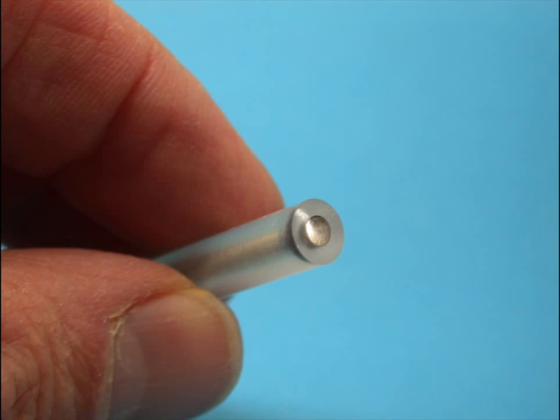In most cases, we would like to have the reaction of interest occur at an inert electrode. We call such an electrode the working electrode. It merely serves to transfer electrons to or from the species under study.